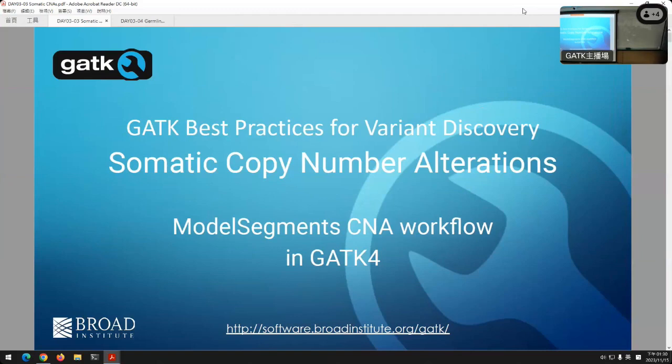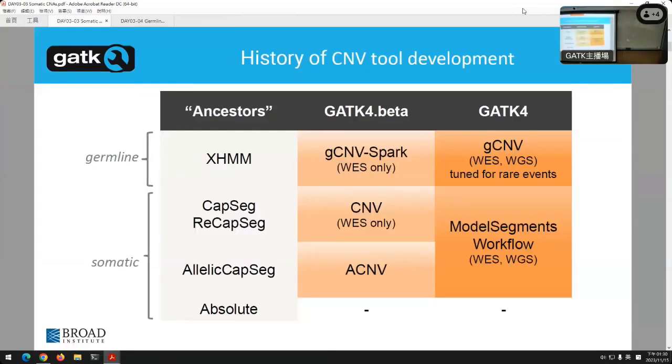I'll also warn you that the somatic workflow is very complicated. All of it is put into a WDL to make it easy. And again, you're welcome to see how we do that and download it and run it in your own bash script or whatever you want.